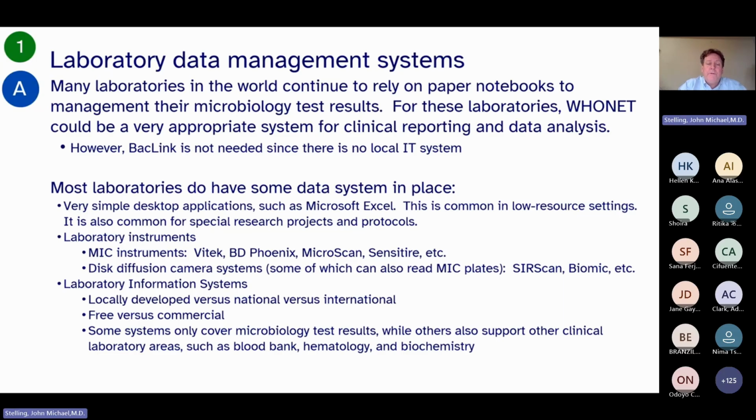Finally, many labs in the world do have a lab information system. I will abbreviate that often to LIS, Lab Information System. Other places in the world often call it a LIMS system, Lab Information Management System. Some people think there are small differences, but from my perspective, the way that I use it, I will talk about LIS or LIMS in the same way.